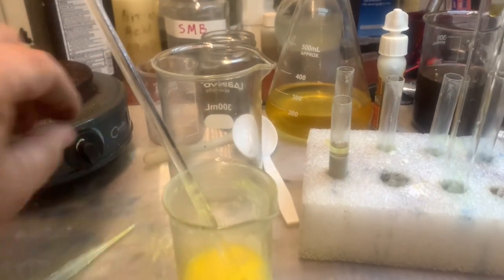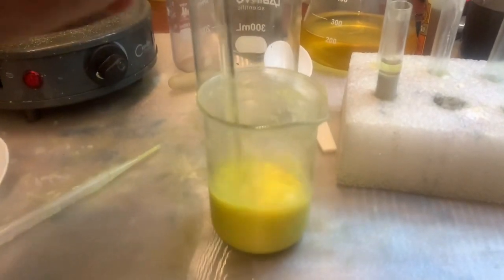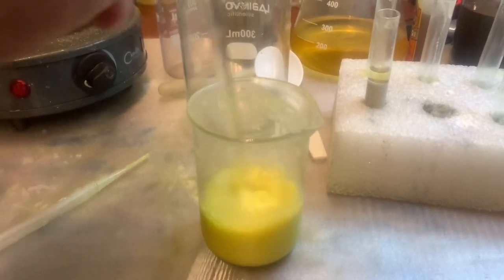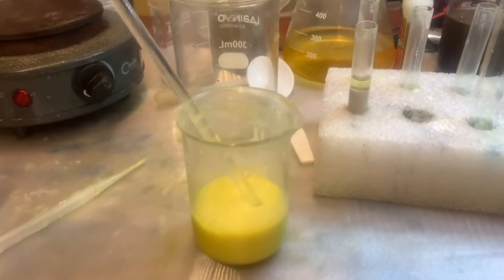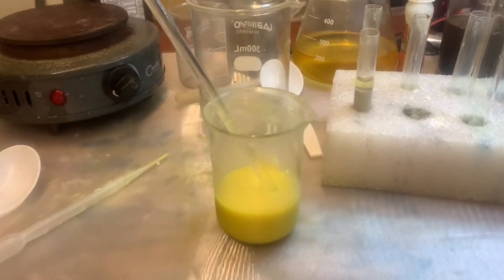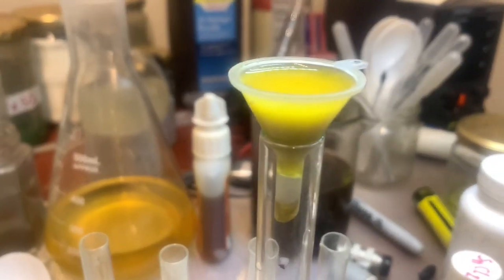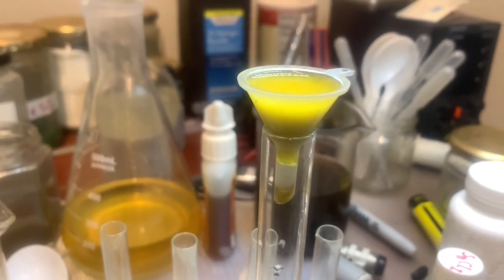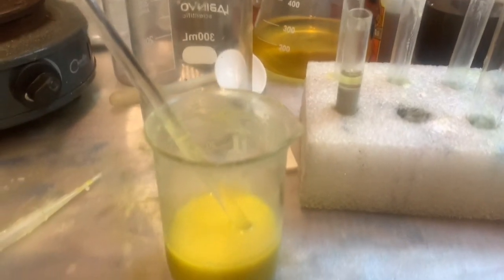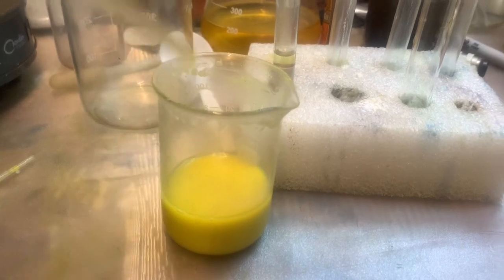Let's try put urea for right now to kill the nitric. Okay, we kill the nitric, then maybe be better. Everything falls in the bottom faster. Okay. And let's see. Okay. Filtration not going well, so need to do something. So let me wait. Let him settle down. This is a silver chloride anyway on surface.